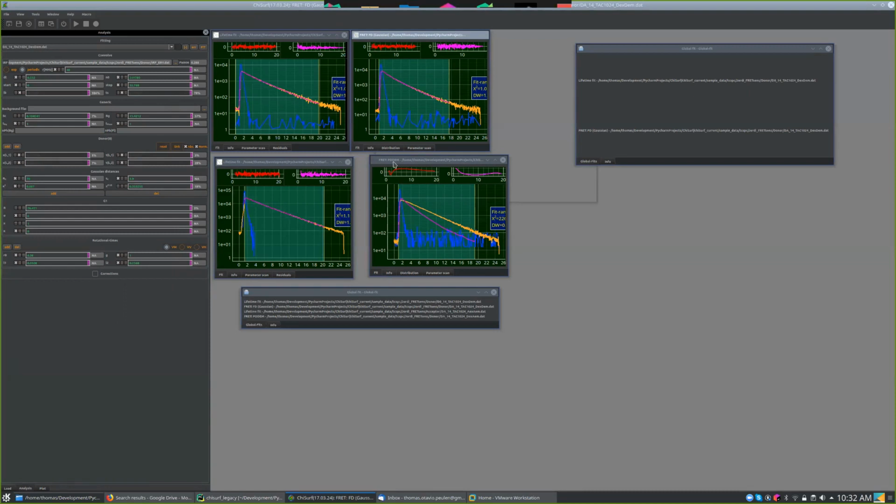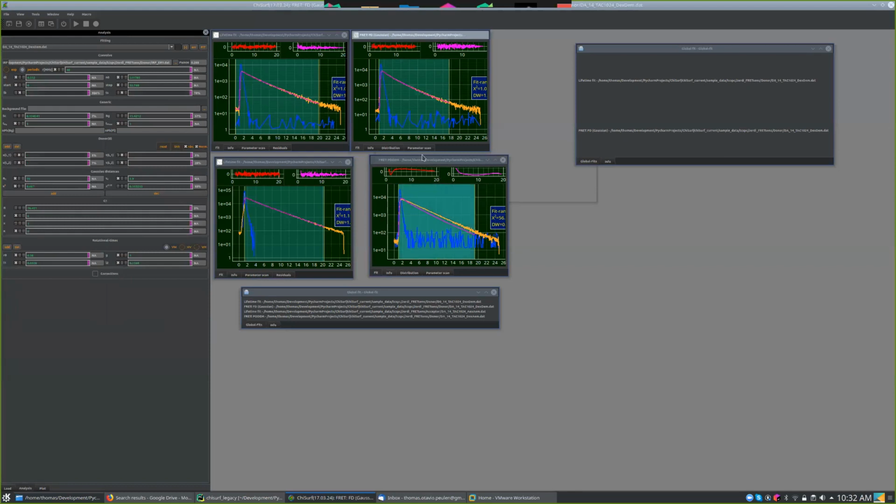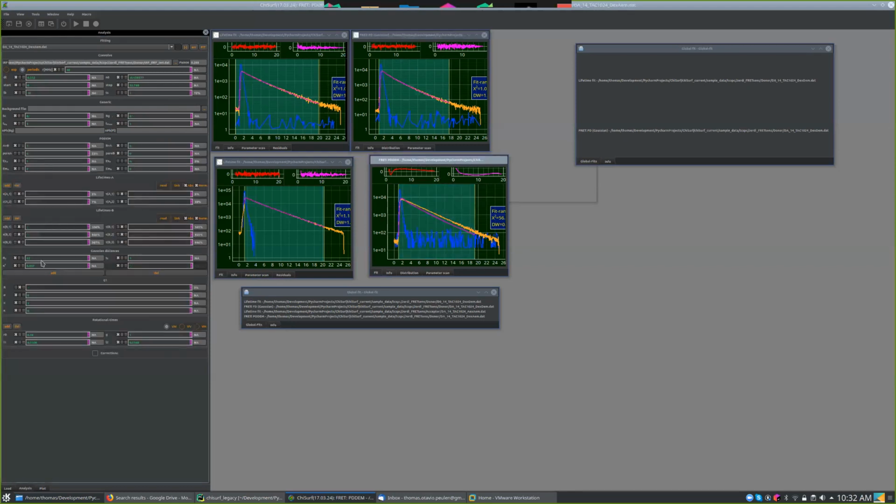And what do you expect? 70. Okay. You get 76. Yeah, there's always a small contribution. For the outer distance, I would assume I'd solve a smaller one.